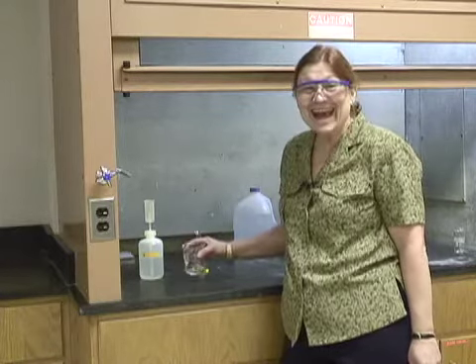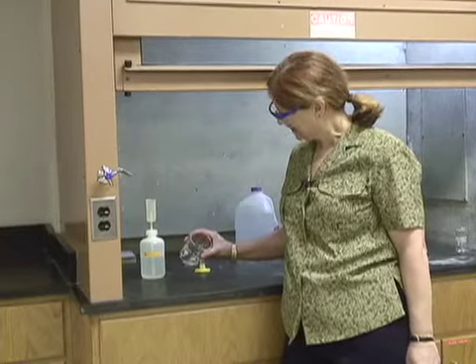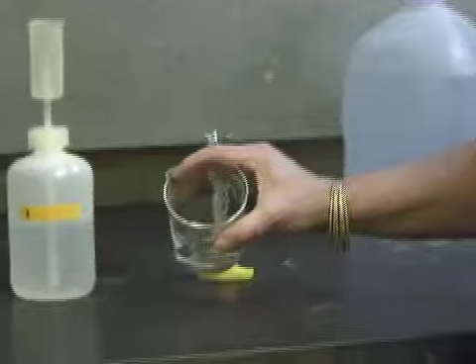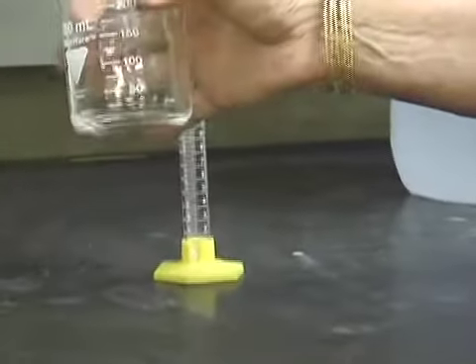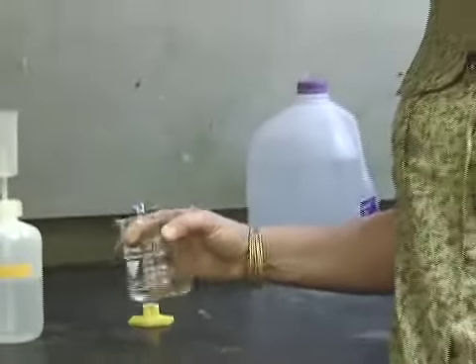Ooh, just one little tiny, tiny piece. And there it goes. See, there's no more. The solution is clear. It's no longer bubbling. And now I will see you at the Bunsen burner.